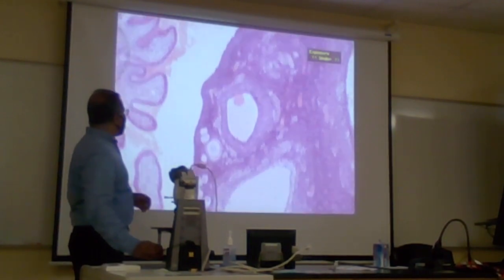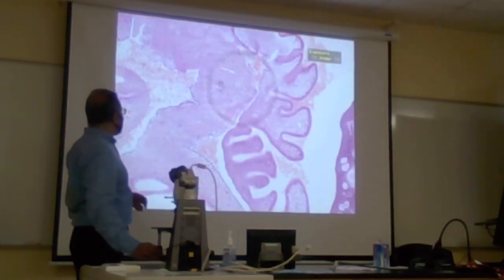I don't see a clear composition in there, so let's look at another one.